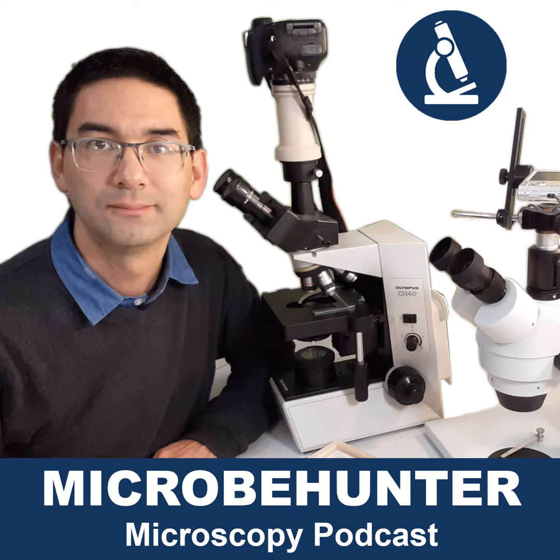Okay, one might now ask, well, if you can actually have a USB camera with a laptop and a microscope, why even bother to have eyepieces to look through? Is it simply not enough to have a camera only, and then have a very simple monocular microscope with one eyepiece, and you take out the eyepiece and put a camera in there, and you don't even use the microscope for looking at all, you just use the screen? You also don't do that.